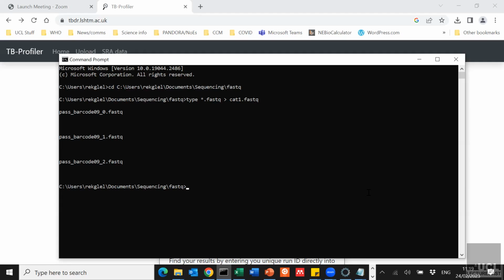Has everybody managed to concatenate happily on their versions? Anybody got any results yet? It might be slow because we're all now uploading stuff.